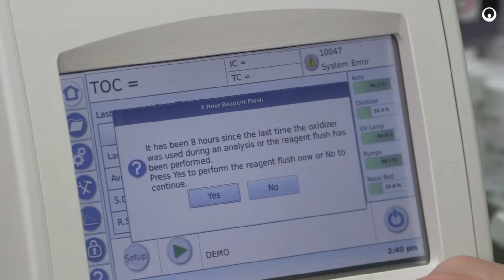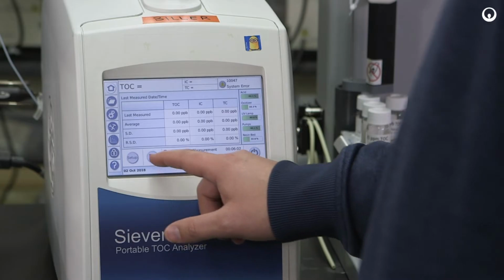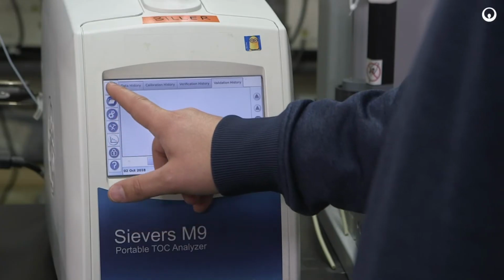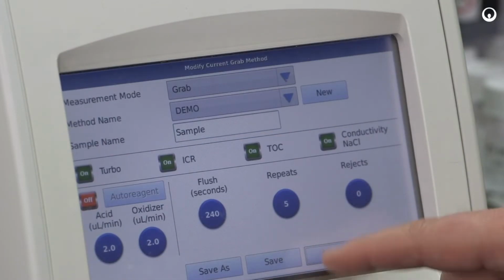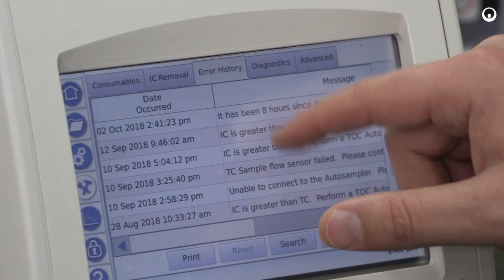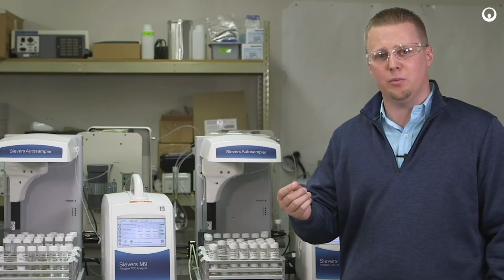One of the non-specific options for measuring the success or the effectiveness of a cleaning validation process is total organic carbon, or TOC. And when it comes to TOC technology, one of the things that makes that method extremely reliable is the ability that it's quantitative. And the only way you can actually maintain the quantitative nature of TOC is if you have an interference-free measurement.